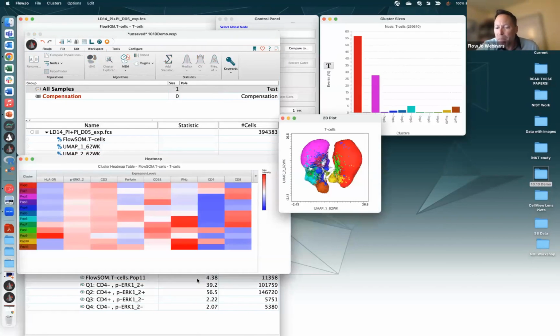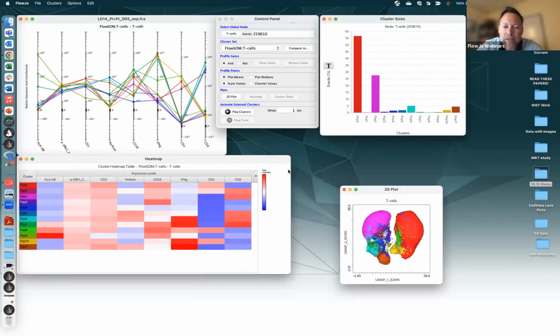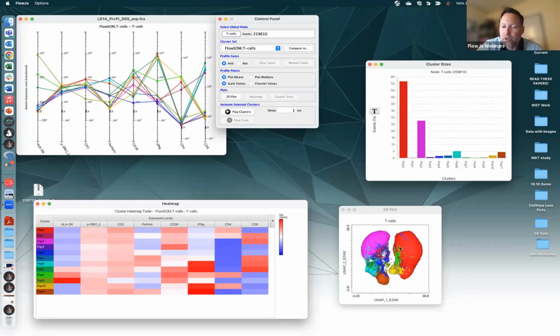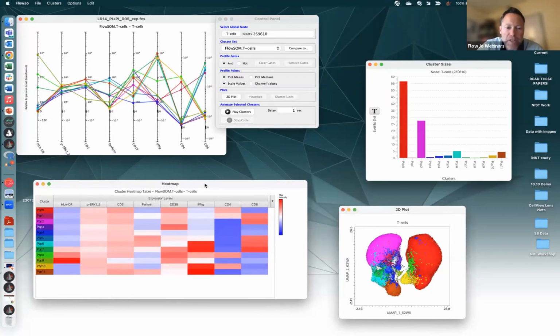That's going to think for a sec and pop up a whole bunch of different views of that data. There is not a template for Cluster Explorer. It is actually an interactive tool, so it works a little different every time you do it, depending on what data you have fed into it. Okay, and this one is stuck behind my Zoom tools. Can I move this? Oh, awesome. Well, that makes it harder if you're using Zoom simultaneously because the Zoom controls are right in front of half of my controls. What we've got here is a line plot, bar chart, UMAP view, so any kind of 2D plot is fair game here, and a heat map chart of all of our clusters.